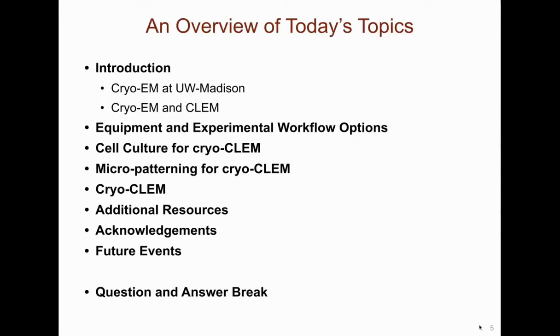To get us started, here is a brief overview of today's webinar. I will introduce Cryo-EM at UW-Madison and mention some key reasons for why cryo and why CLEM. From there, I will discuss cryo-CLEM equipment options, workflows, and laboratory layout requirements.